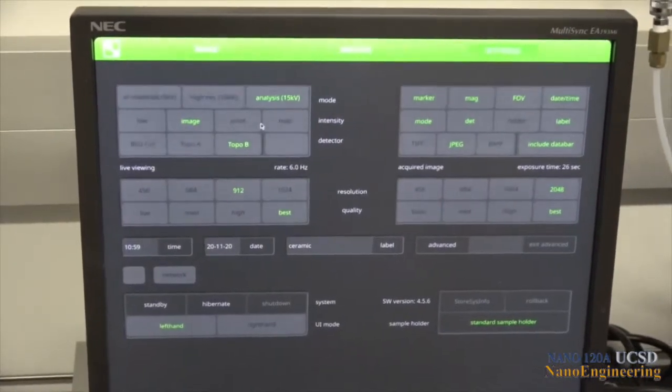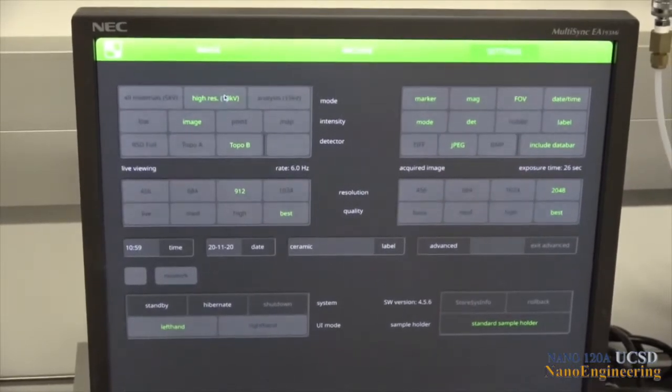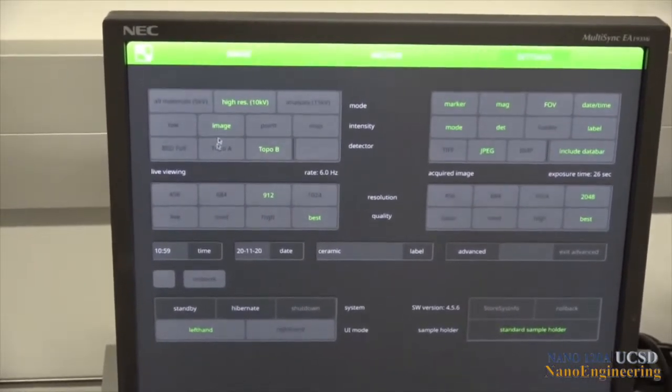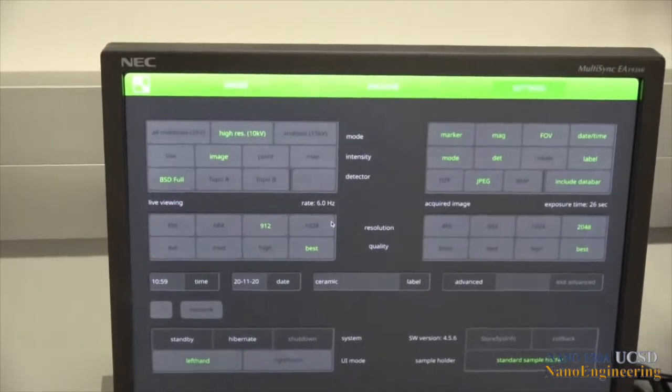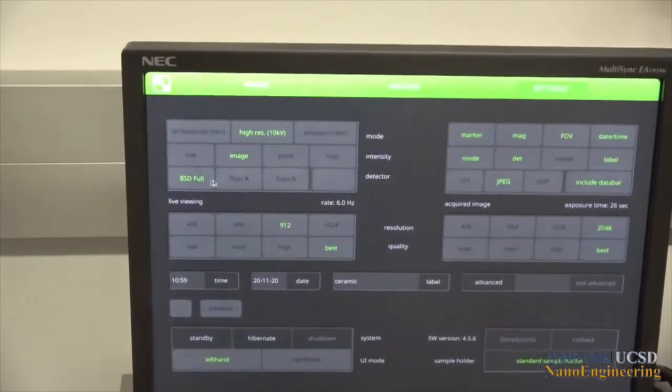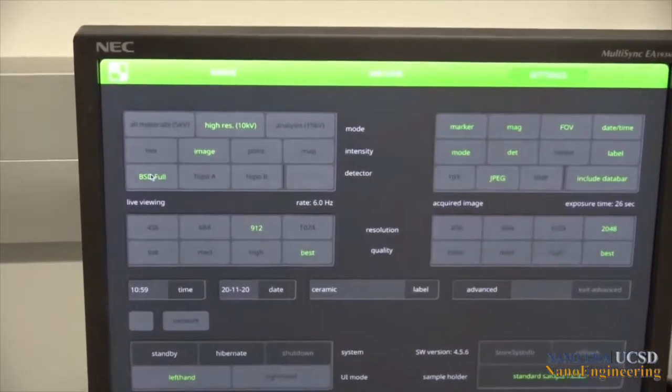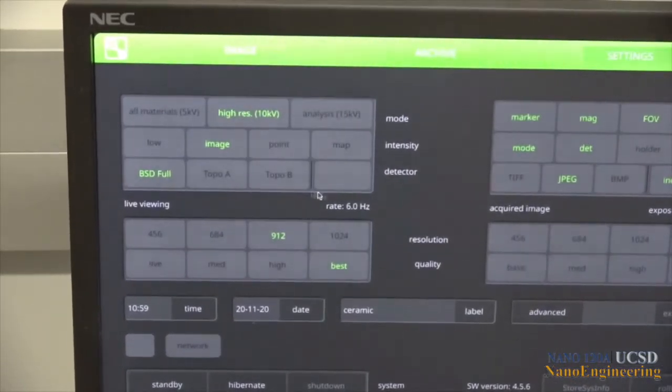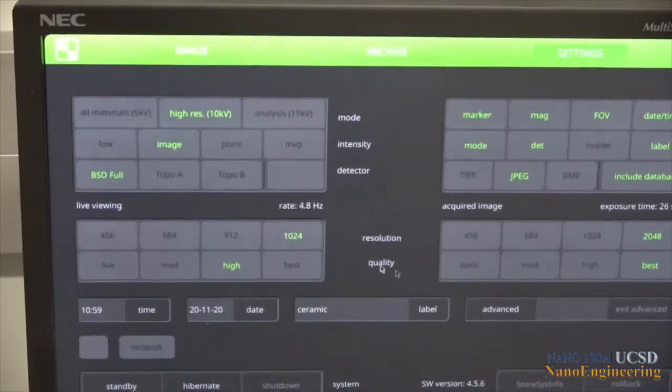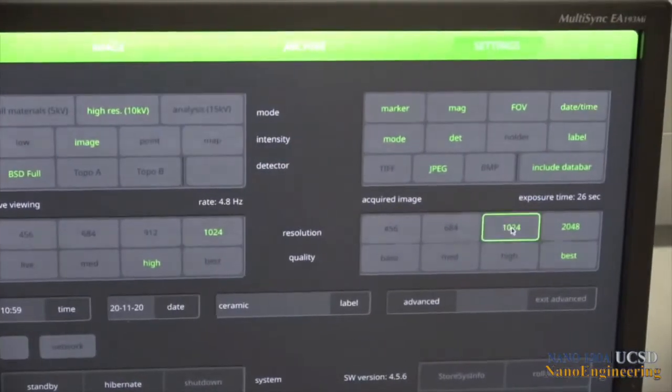To set up our microscope for imaging our sample, we choose the 10 kV accelerating voltage and an adequate spot size beam current provided by the image icon selection in the intensity menu. In this demonstration, we will show how the image can vary with our choice of detectors, starting with the backscatter full mode and then moving into the topo A and topo B modes. We'll start with the BSD full and set up the viewing screen image parameters prior to moving the sample into the SEM portion of the microscope.